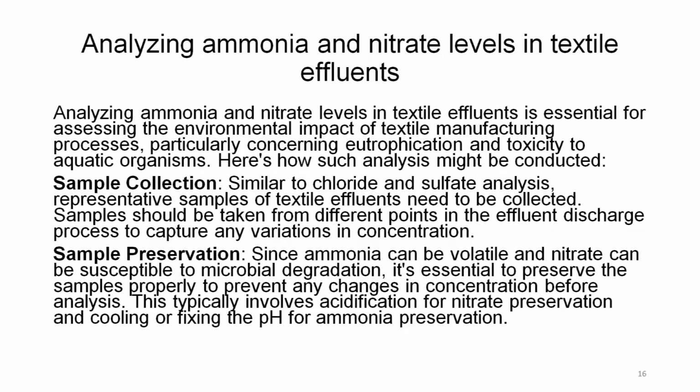Sample collection. Similar to chloride and sulphate analysis, representative samples of textile effluent need to be collected. Samples should be taken from different points in the effluent discharge process to capture any variation in the concentration.